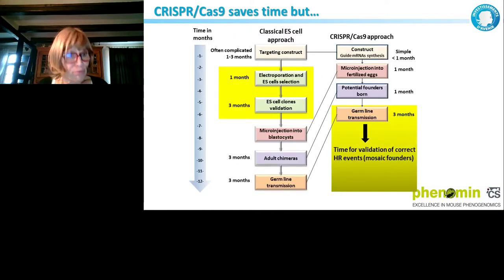Okay, and now to almost finalize what I want to say, CRISPR-Cas9 is great. I showed you that. But I think you need to really think carefully, at least at our place, what you want to do. I put a scale, the time in months, and you need just to realize that the time to fully validate an allele when you are working with ES cells takes the time of the cell growing, and you can do plenty of PCR on your clones, check that everything is correct, and you will spend your time validating everything in ES cells and only inject one clone that is really perfect, and it's really great when you do big, large modifications.